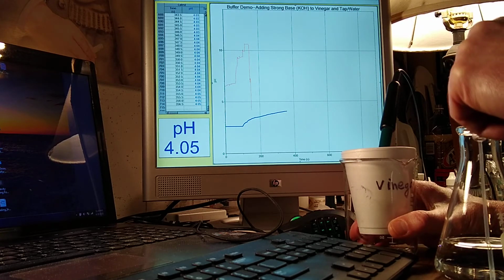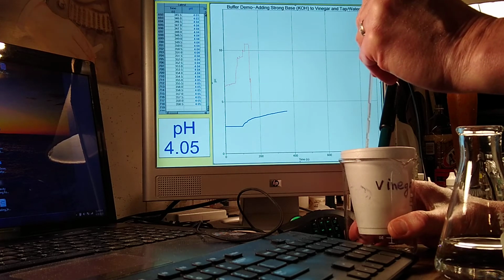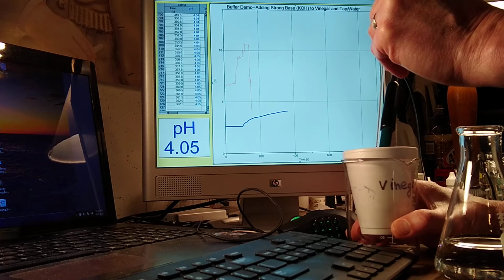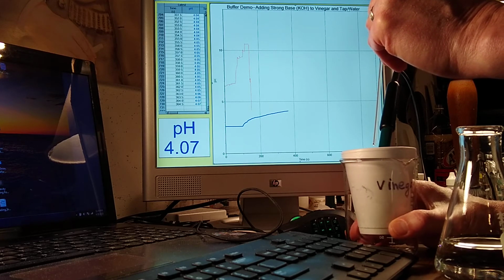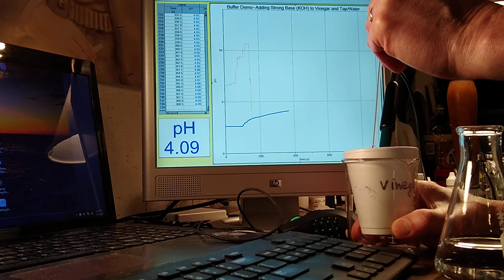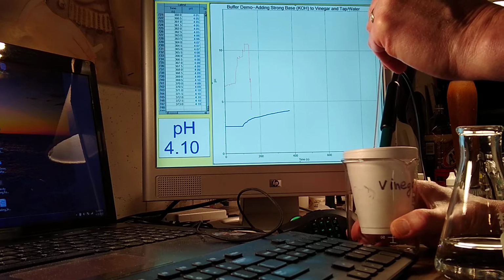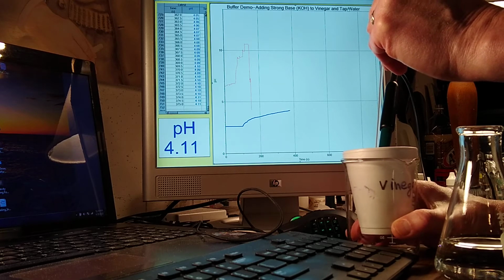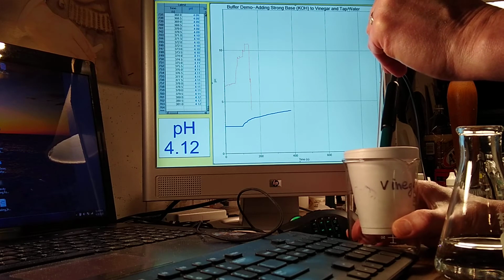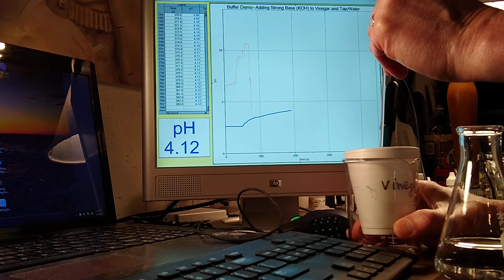But you've got to remember that at the beginning of this titration, I had a lot of acetic acid molecules in this cup. And so as I added in the base slowly, as I'm doing here, those acetic acid molecules are slowly being converted into the conjugate base, which is potassium acetate or acetate ions. The potassium ions are just spectator ions. They're not doing anything. And I'm also making water molecules.